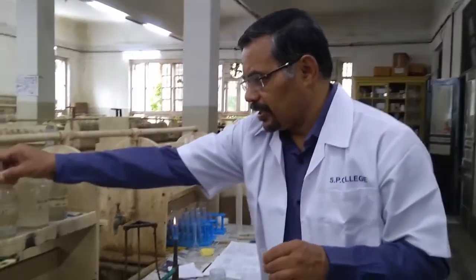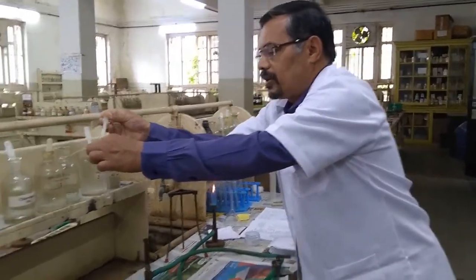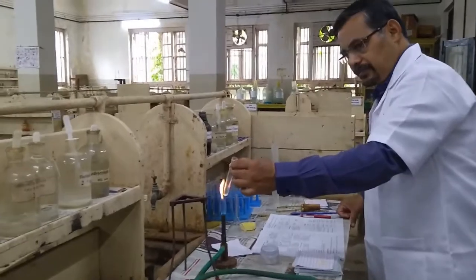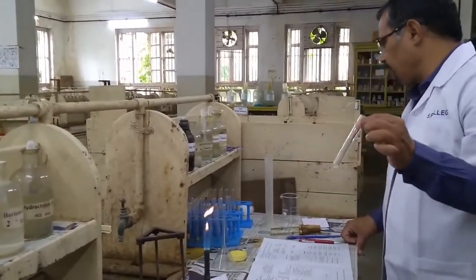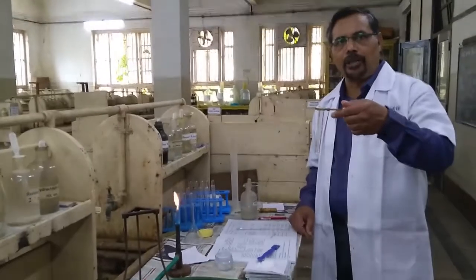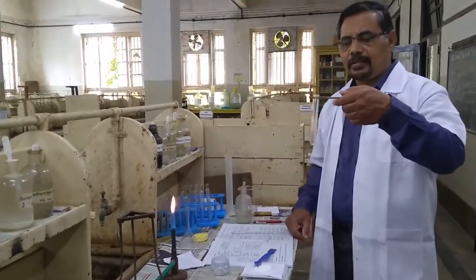So we will add here a small quantity of sodium hydroxide solution. Then we will heat this on the flame of this burner. During this heating, we will check turmeric paper. So, the action of NaOH, this is the next dry test.